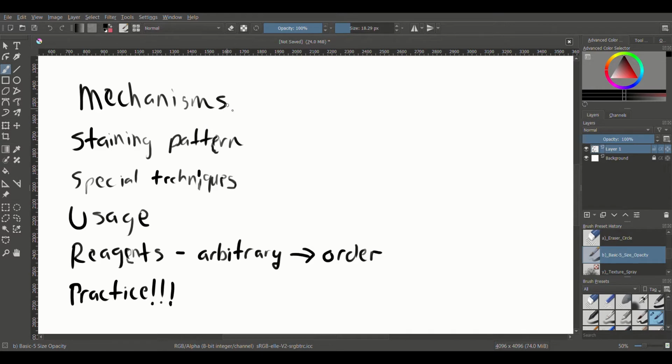And before we get started with the actual stains today, I'd like to just recap some things to look at when you're studying. Especially when it comes to special stains, it can be really hard to take in all of the information that's contained in your text and put it in any kind of logical order, because you don't want to just memorize the steps and the reagents like it's a cookbook. You don't want to just know them, you want to understand them. You want to know why you're using a certain reagent at a certain step. So I thought about some ways that I studied, and hopefully this helps you out.